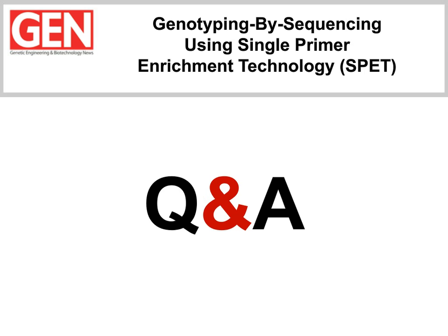This is John Sterling, Editor-in-Chief of GEN, and I'm going to be handling the Q&A. So my first question is for David. How does the NGS system remove ascertainment bias? Can you please elaborate?